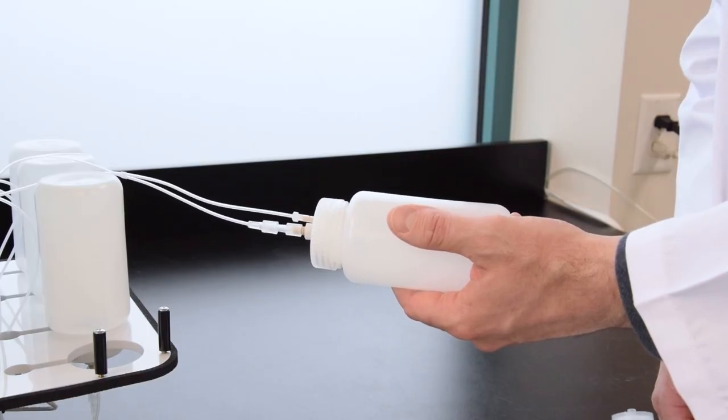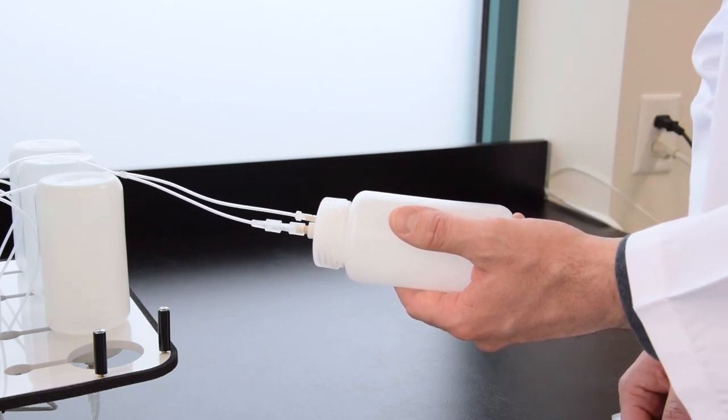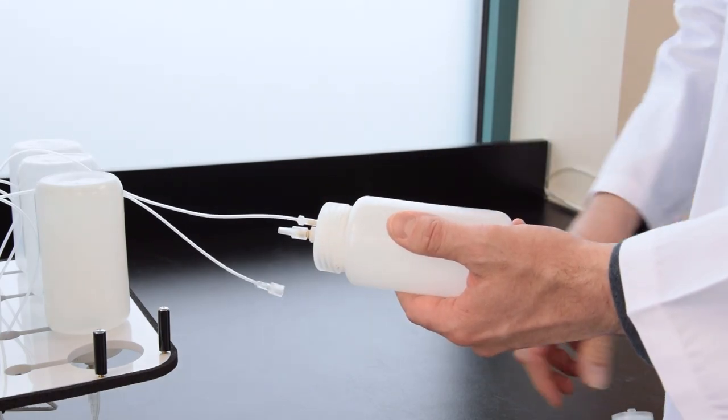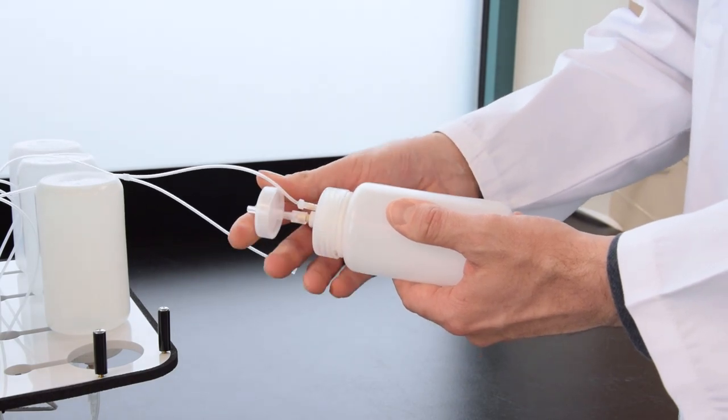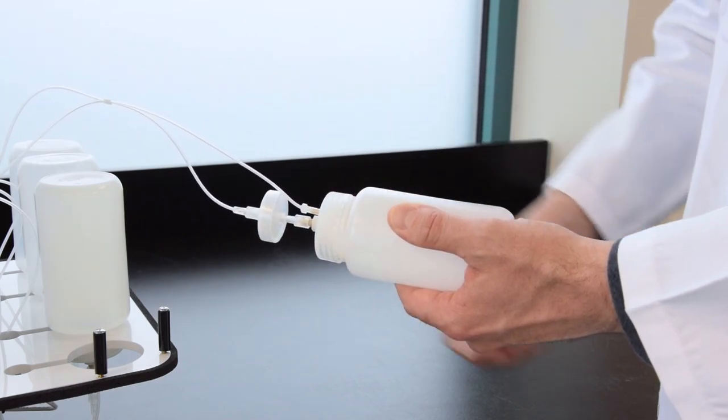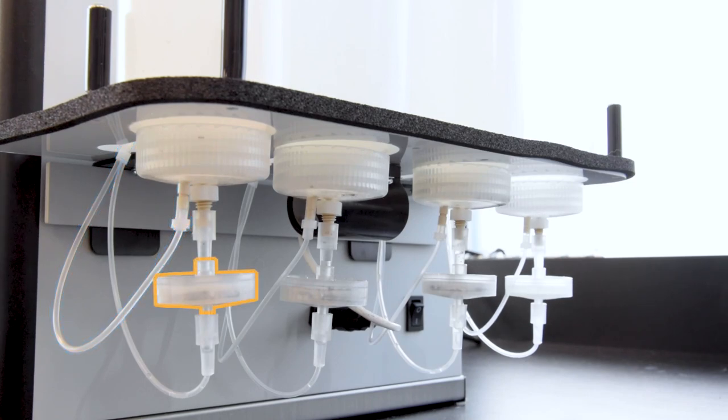If you look at this sample bottle adapter, you'll notice there are two lines, whereas the original configuration for methods 537 and 533 only has one. The main line is responsible for drawing sample and comes with a lure fitting for our high capacity inline filters. The additional line on the side is used for rinsing the sample bottles and it bypasses the main line. Interesting! So what you're saying is that by using this dual line design, the solvent rinse is not impeded by particulates that are trapped in the inline filter, which makes it more suitable for non-potable samples.